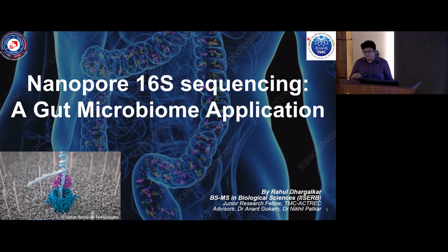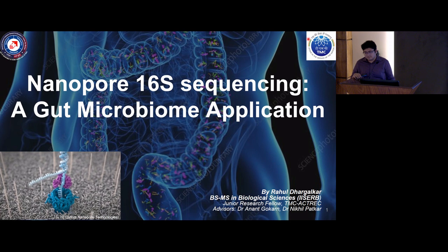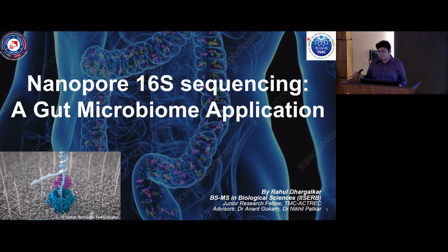And plus, routine sequencing is also very cheap. What he didn't show was that there is something unique about Oxford Nanopore. You buy one flow cell of the Minion, you use it today.